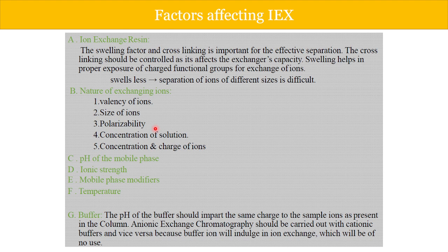That is very important, and this is a very important factor for any kind of chromatography, not only ion exchange chromatography. If you speak of any kind of chromatography, these buffers are very important. So you need to keep in mind these factors which are important for ion exchange chromatography.